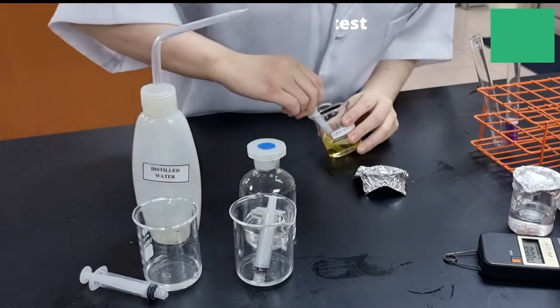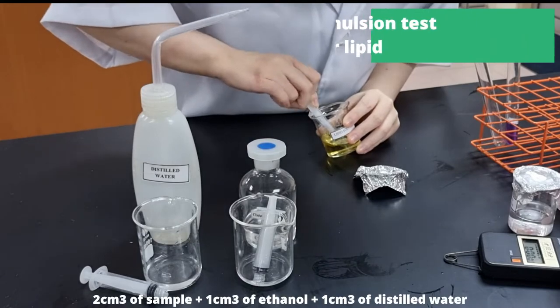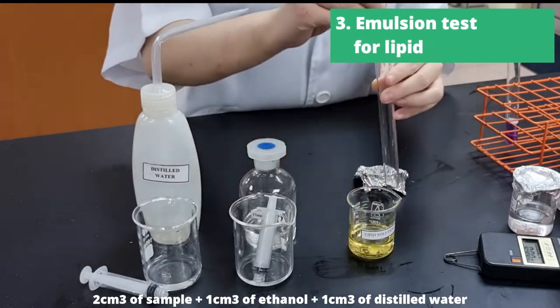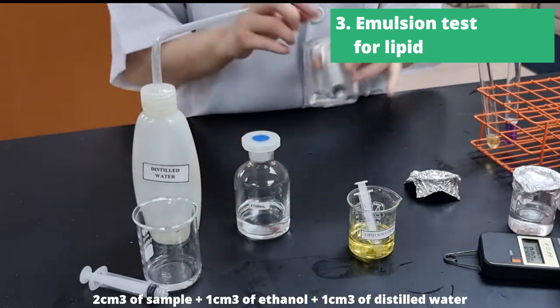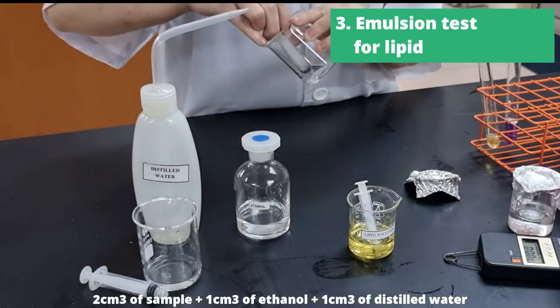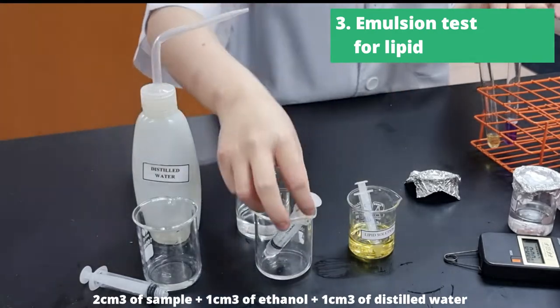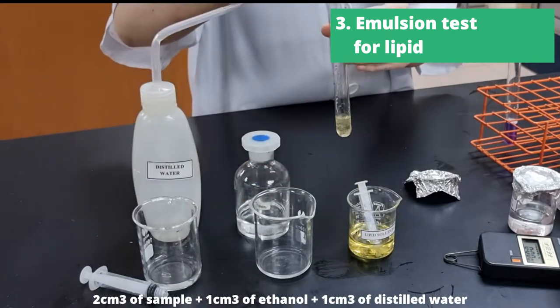The next test we're going to do is the emulsion test, which tests for lipid. Lipid is soluble in ethanol but not distilled water. So in the emulsion test, we take 2cm³ of sample, we add 1cm³ of ethanol to it, and then we add 1cm³ of distilled water.